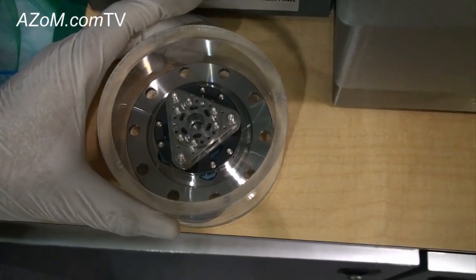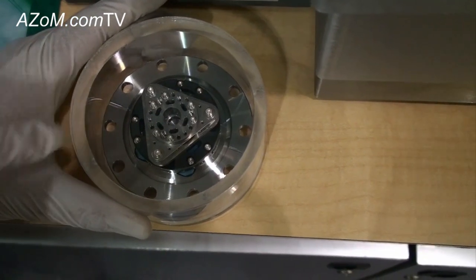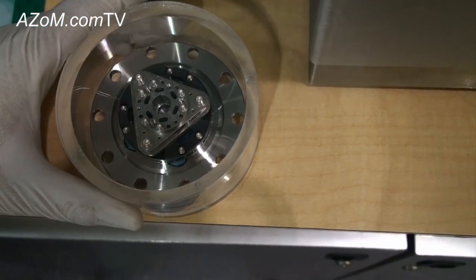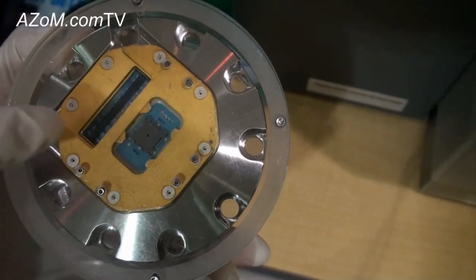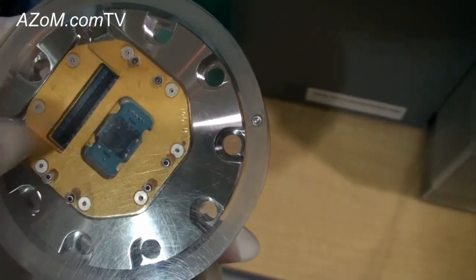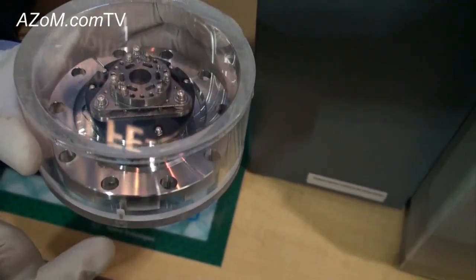Here is the whole electron beam lens with the tip as the source on the top of the electron beam column, and also on the back side is the aperture where the electron beam comes from. Sitting in this cutout is the detector, so this is the whole electron source, electron beam column, and also the detector.